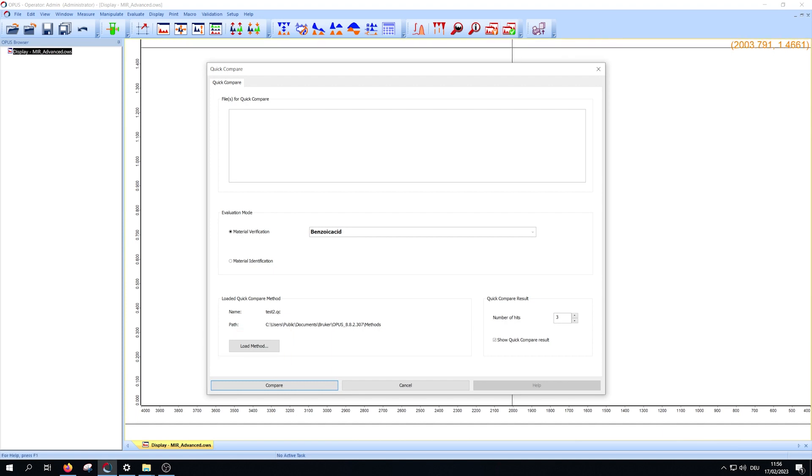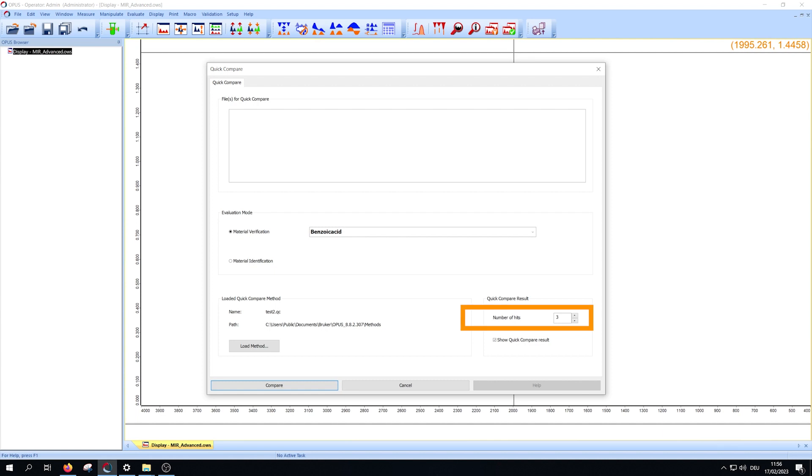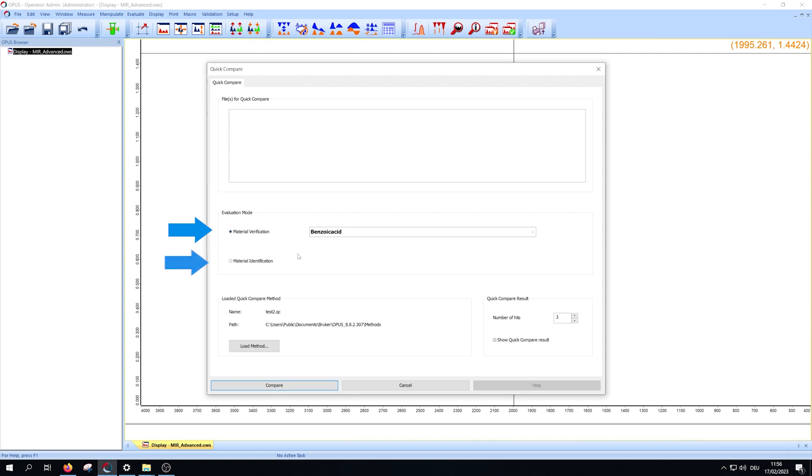In the lower right part of the window, you can change the number of references you get in the correlation info. You have two possibilities to use quick compare: material verification and material identification.